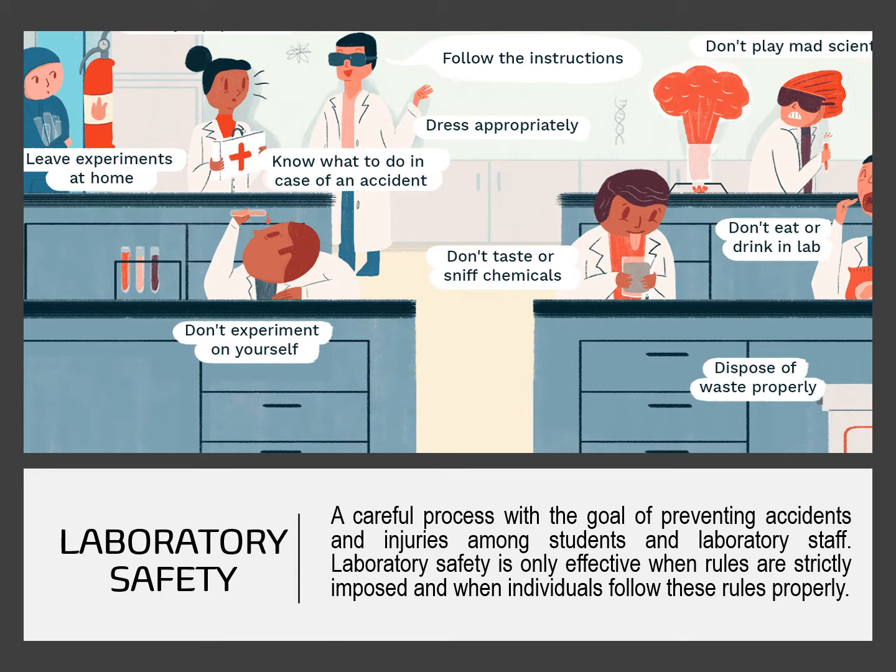If you take a look at the illustration above our definition, we can see people working inside the laboratory, and we can see here some descriptions that will tell us if that person is properly following the protocols set inside the laboratory. So take for example this person here. He is trying to experiment on himself by placing the sample on his eyes, which is very incorrect because we do not know the nature of the samples we are processing inside the lab. So we do not let these samples touch or get inside our system through our mucous membranes.